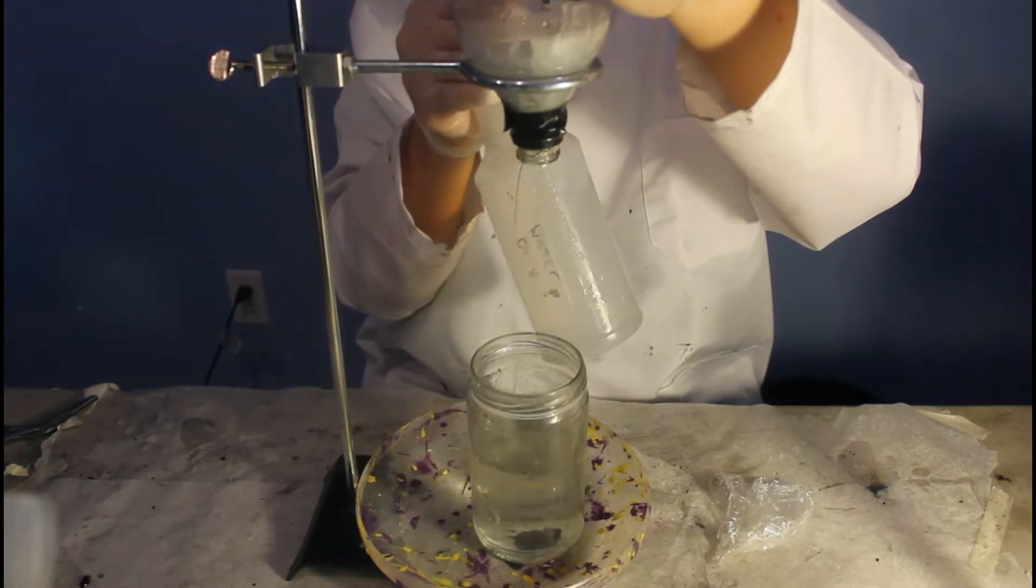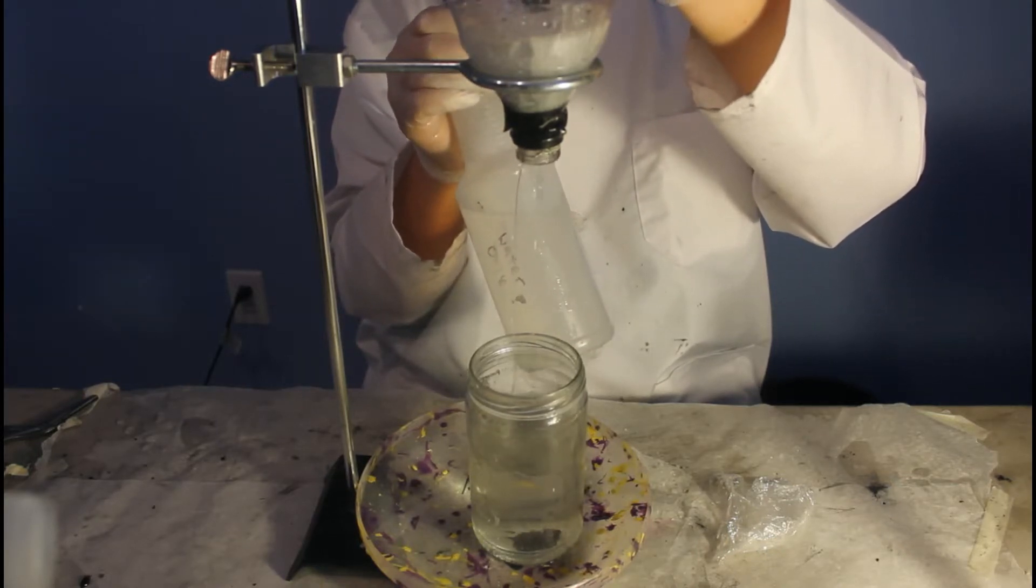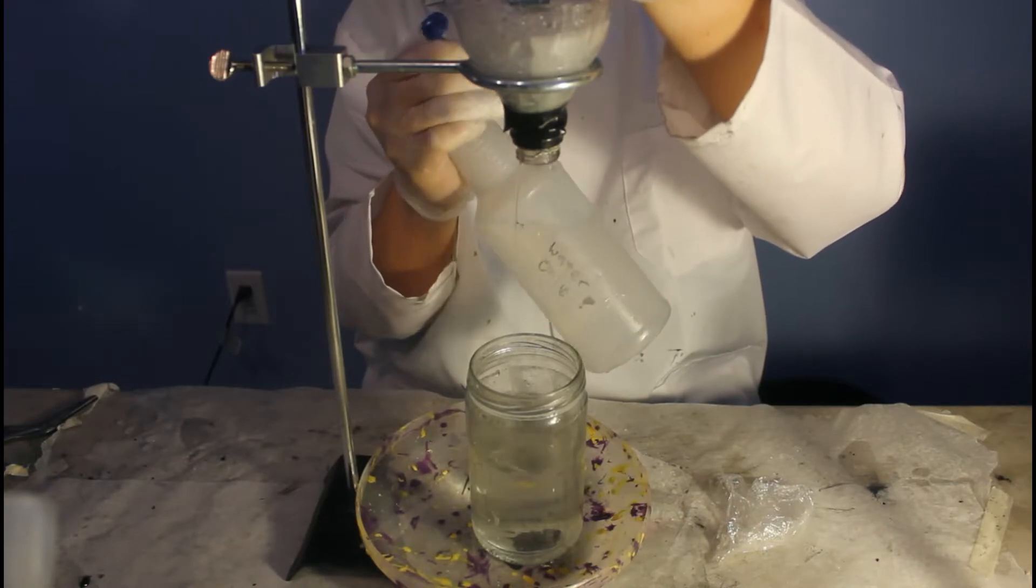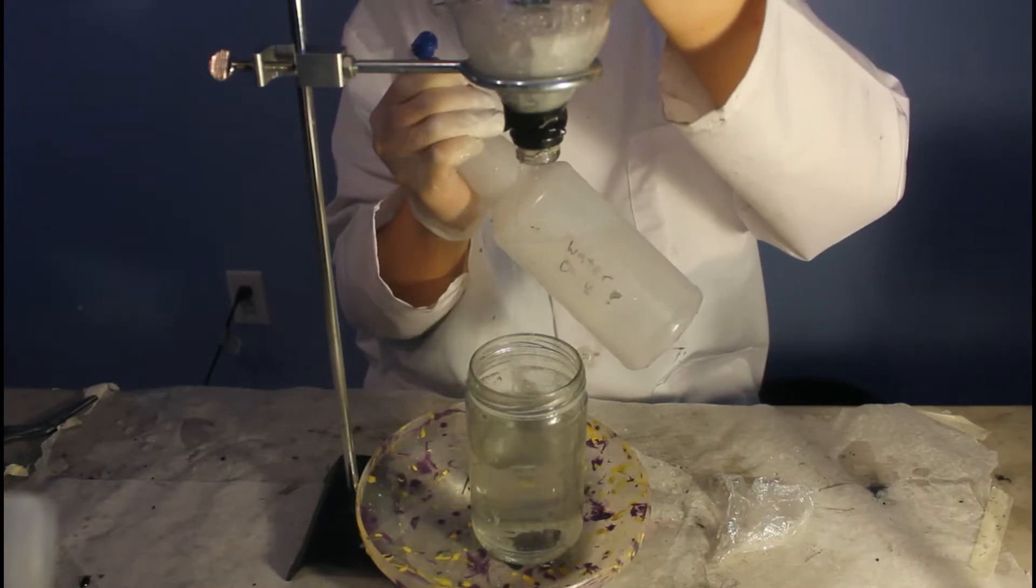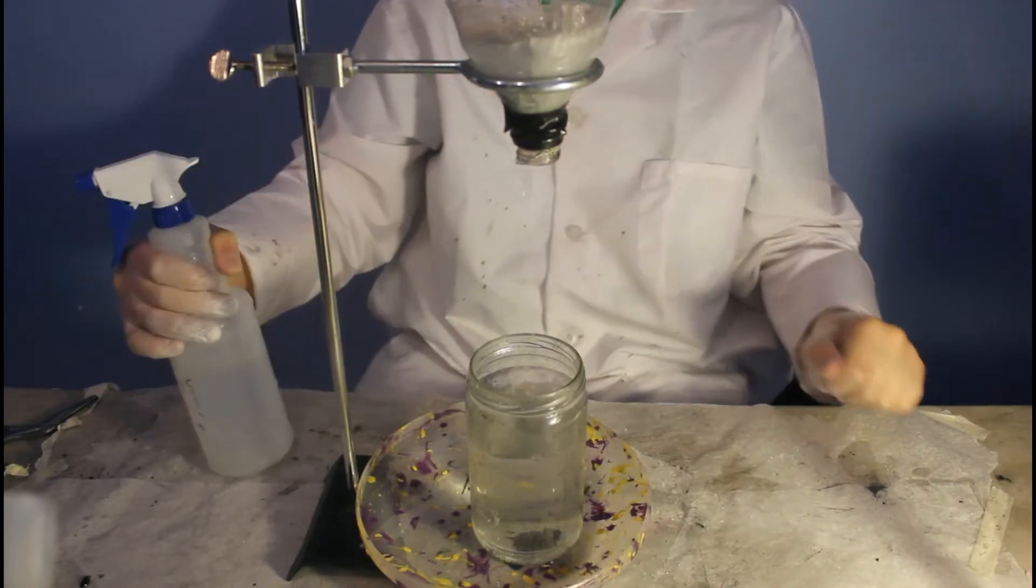A wash bottle is used to wash out any remaining zinc into the filter. The funnel is then topped off with deionized water and it is left to filter.